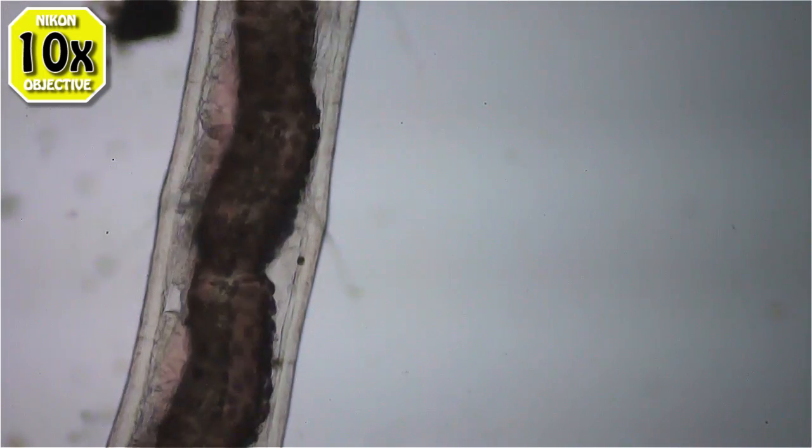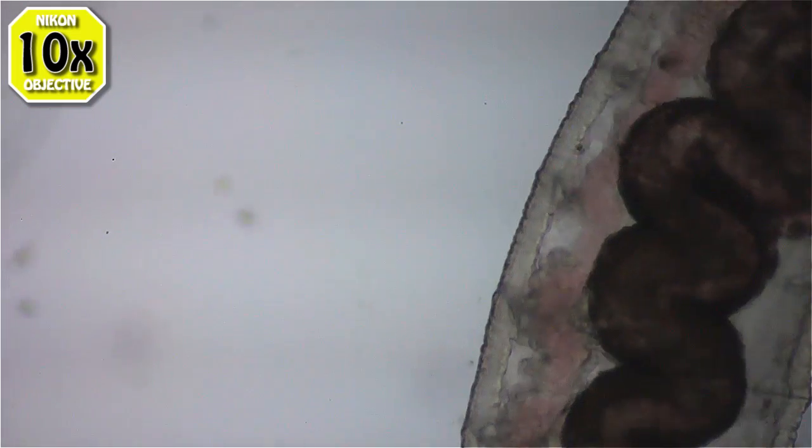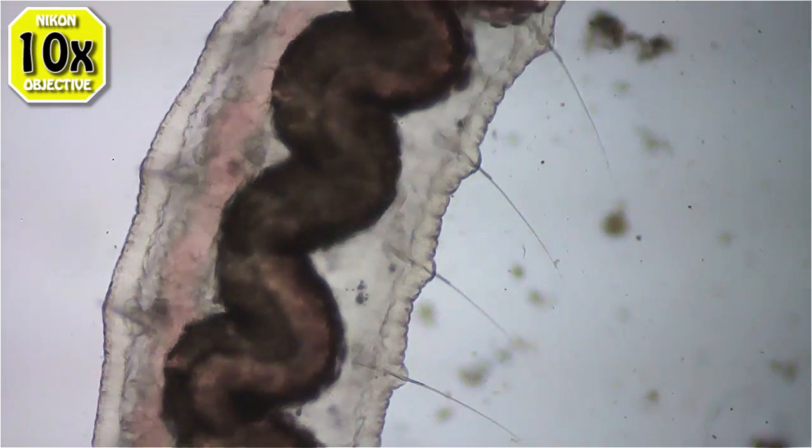I'm using a Nikon Fluofot scope, built sometime in the early 1980's. Here's the head. You see as soon as the light hits that he's out of there, he doesn't want any part of that, which is kind of bright and I don't blame him.